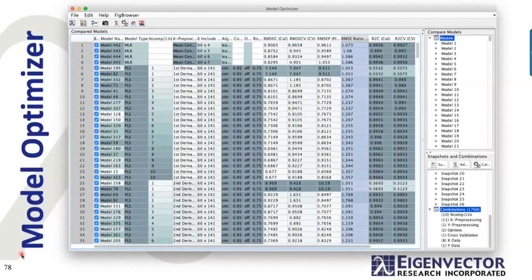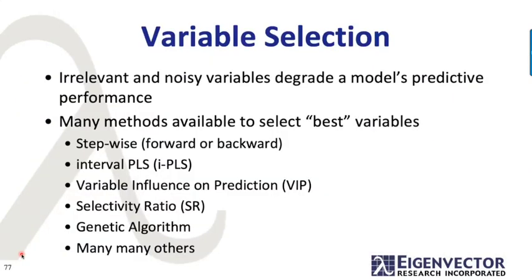I had a question about removing a known interferent from a spectra before you model. Yeah, the problem with that tends to be you have to do it exactly right. And if you don't, it just messes things up. So it's usually better to let the model handle it than it is to try to subtract it out beforehand. I've seen too many instances in the past of where people try to do that.